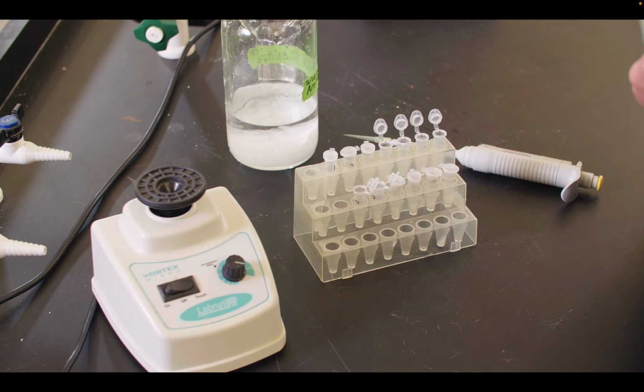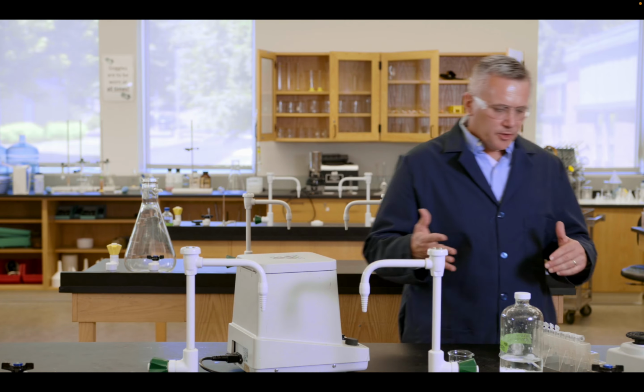And also there can be some heat with the dilution. So we want to make sure we do this slowly so that we can repeat it once we get to a bulk where we're going to take all of our fraction 2 and try to add ammonium sulfate to do the 2 things that I talked about. And so we need to do this slowly. It's going to be tedious, but we're going to take some time to do it.